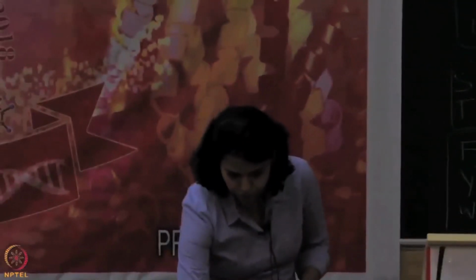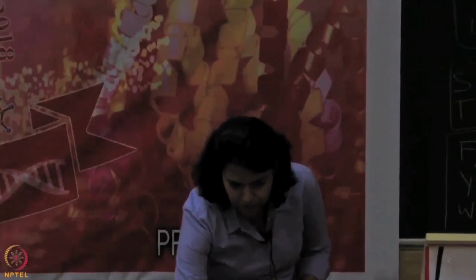Okay. We ended the video on the BaseSpace application. So, I wanted to take you guys to BaseSpace if I can.